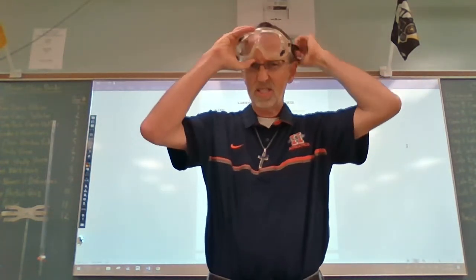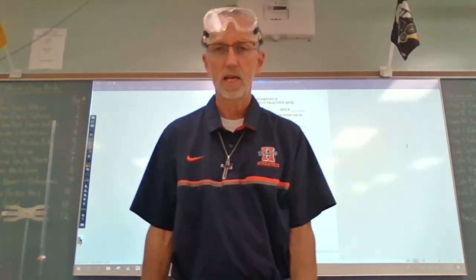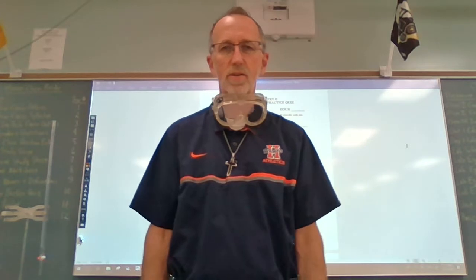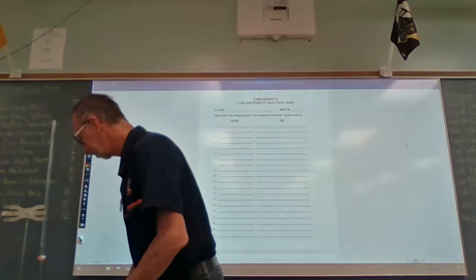So this is how we wear the goggles, like this. We don't wear them like that. I'm not all that interested in protecting your forehead, and we don't wear them like that either because I'm not all that interested in protecting your neck. It's the eyes that are the important thing here. And so that's what they're used for.